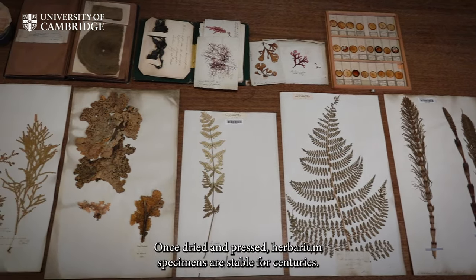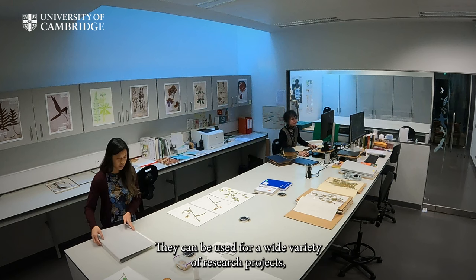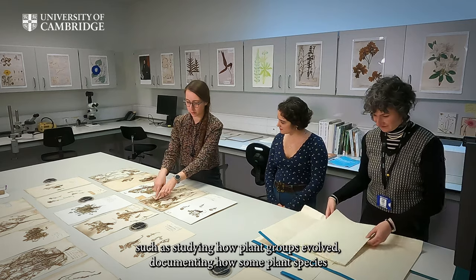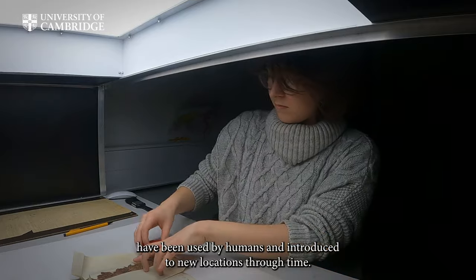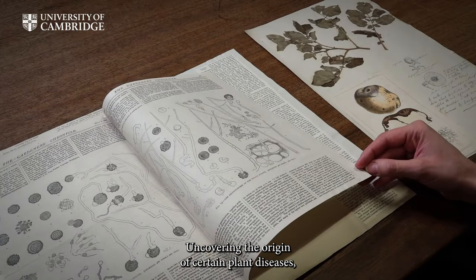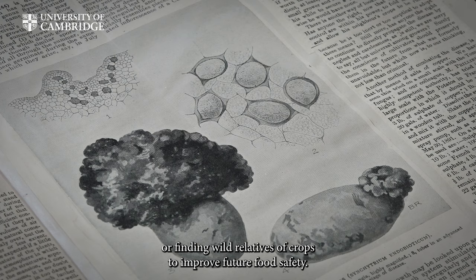Once dried and pressed, herbarium specimens are stable for centuries. They can be used for a wide variety of research projects, such as studying how plant groups evolved, documenting how some plant species have been used by humans and introduced to new locations through time, uncovering the origin of certain plant diseases, or finding wild relatives of crops to improve future food safety.